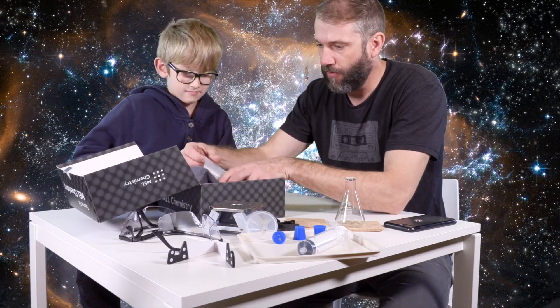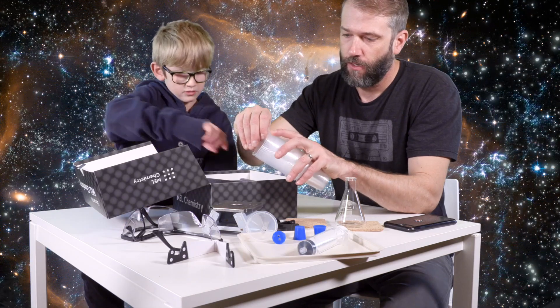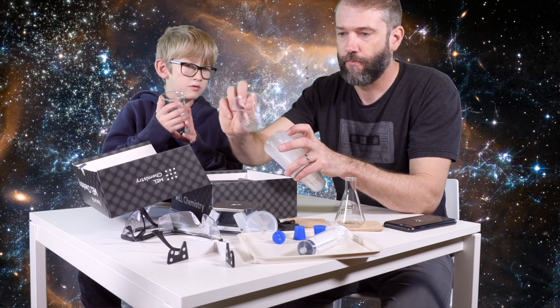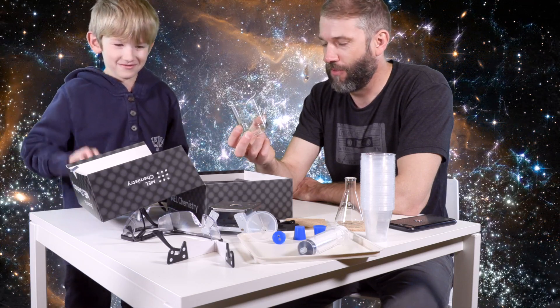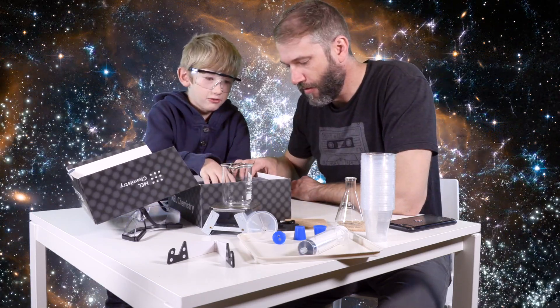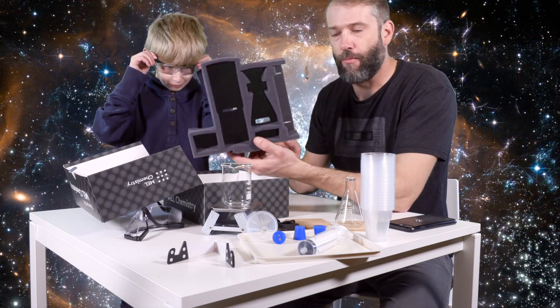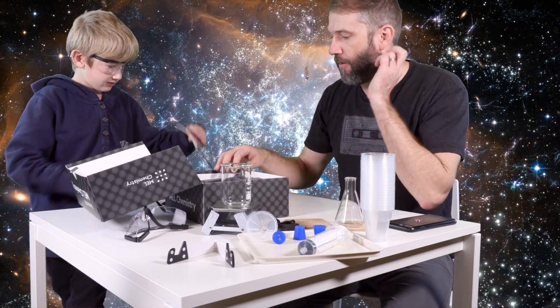Then we have a whole bunch of plastic cups, which I assume are for temporarily holding liquids. This is a beaker — just like your favorite character on The Muppets, it's a beaker! I think the chemicals come from the other boxes. These are just sort of basic labware. This is the rest — that's all that's in this box. This is basic labware that you would need for almost all of the things that you would do.